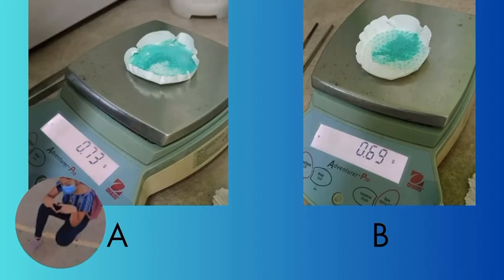So yes, the identification of the limiting reagent by color of the filtrate accurately predicted the yield of product, and the percentage yield for this reaction for trial 1 was 99.9%, and for trial 2 it's 100.2%.